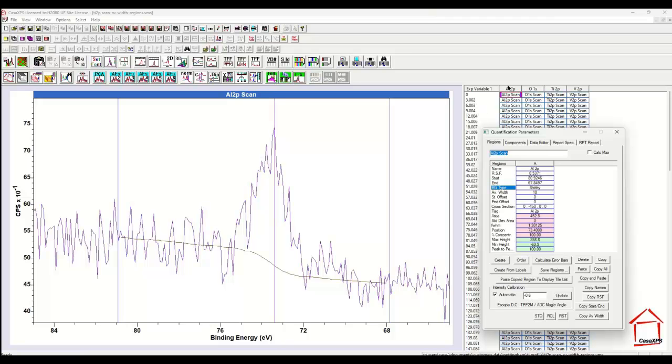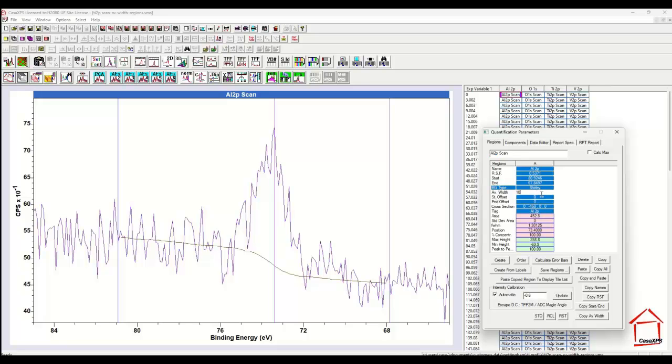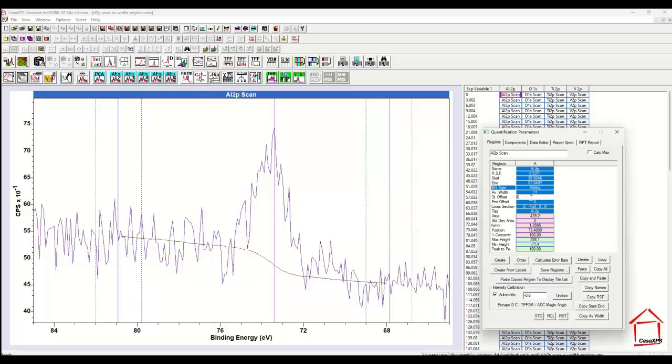I've created a data file previously where I've added these regions, and I've made use of a parameter which is the average width, which is easily demonstrated by changing it. It is a set of data bins that are averaged to determine the point at which the background should meet the data at the start and the end of each region.